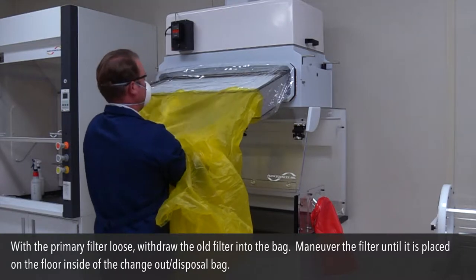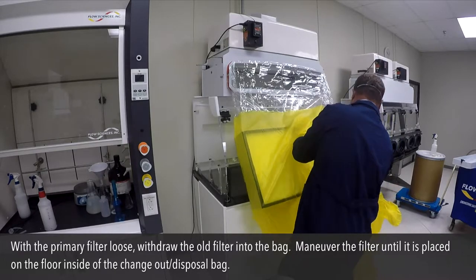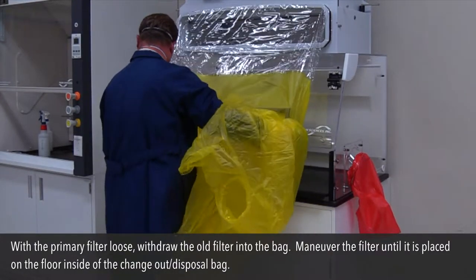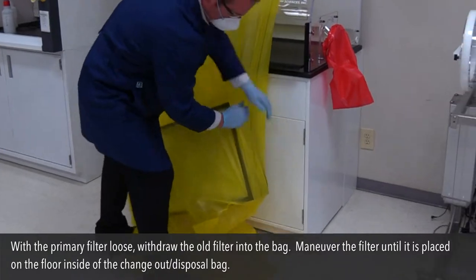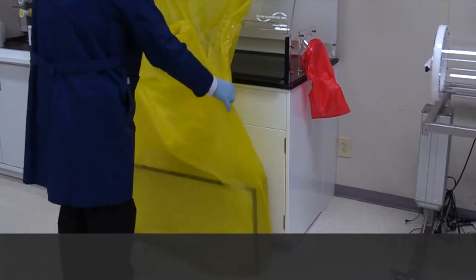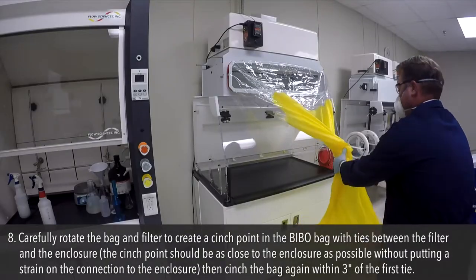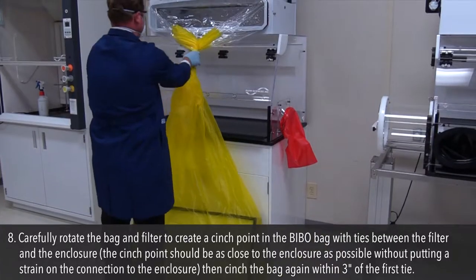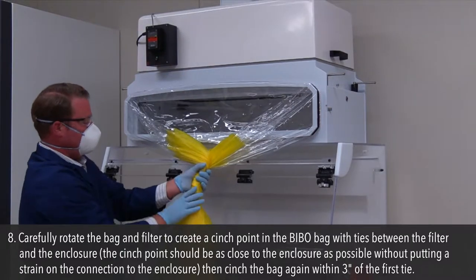With the primary filter loose, withdraw the old filter into the bag and maneuver the filter until it is placed on the floor inside the change out disposal bag. Step 8: Carefully rotate the bag and filter to create a cinch point in the BIBO bag with ties between the filter and the enclosure. The cinch point should be as close to the enclosure as possible without putting strain on the connection. Then cinch the bag again within 3 inches of the first tie.